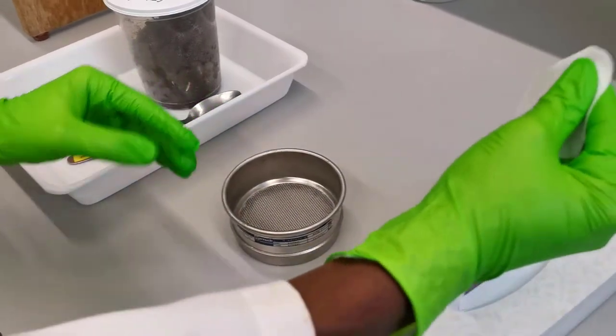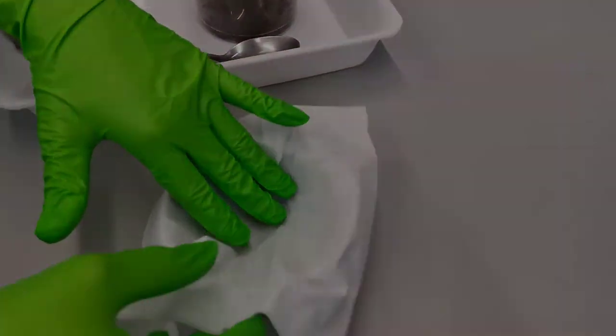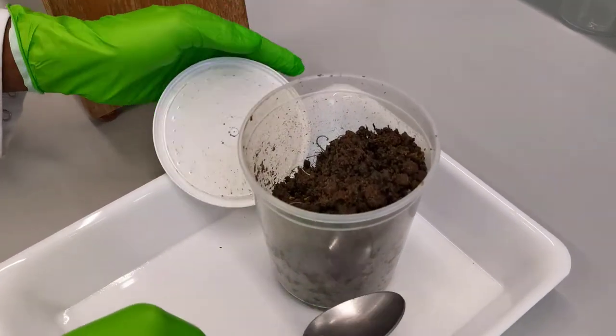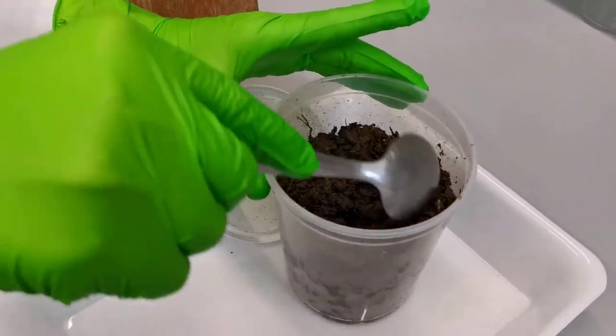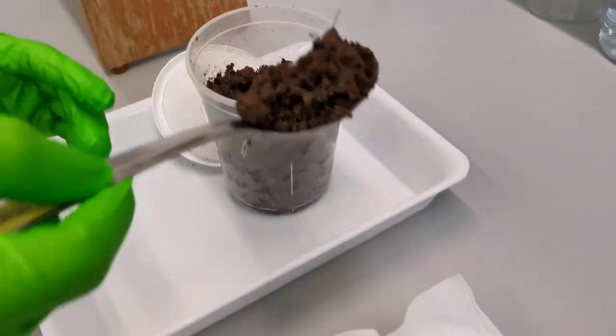Now place a tissue paper on the sieve as shown and add some soil on the tissue paper. Remember you can also use plant materials such as roots to extract motile nematodes depending on the nature of your work.